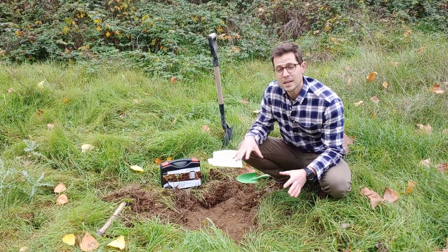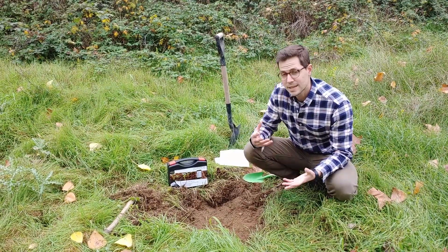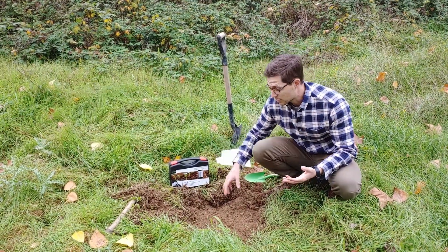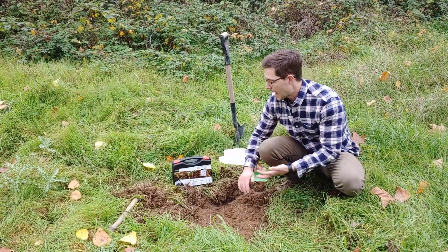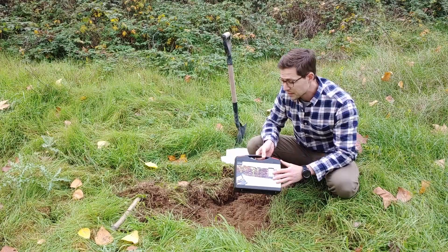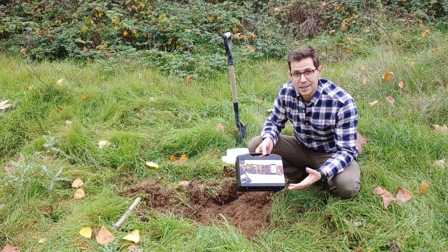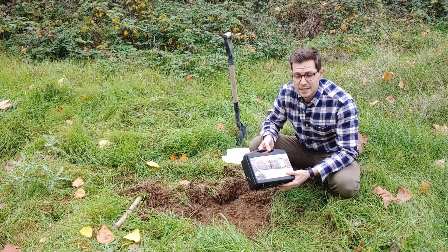We're here on a piece of land that I'm taking a look at for the possibility of being a market garden in the future. I want to test it first to see how good the bacterial activity is and the quality of this soil. I'm trying out a new product here, the Microbiometer, which is specifically to test the microbial activity and the quantity that's in the topsoil of a parcel of land that you're testing.